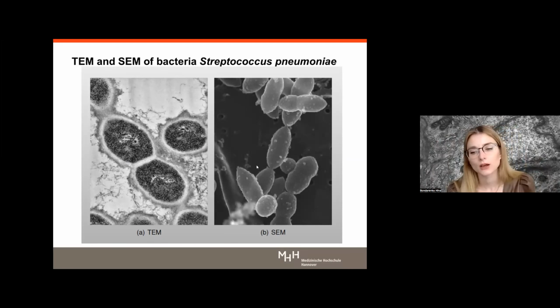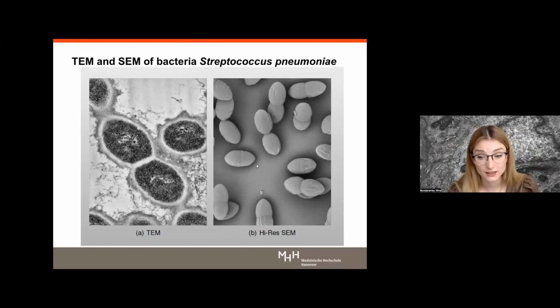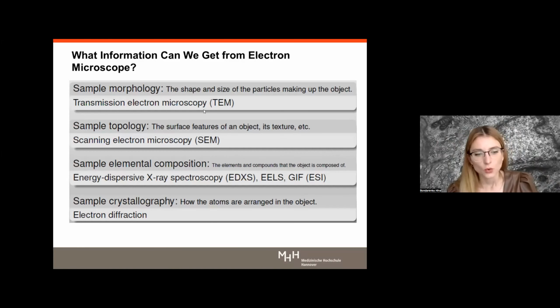So that's why the image will be a bit different. But once again, it is only black and white imaging, so it's a sort of limitation. If you see colored pictures, colored electronograms, that means it's just artificially colored, in Photoshop or other software, just for illustration and simplification of analysis. It's not a real coloring method. So what information can we obtain from electron microscopy?